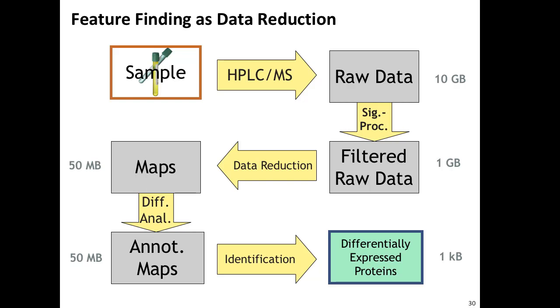The underlying assumption of doing quantitative proteomics is that the shifts in the proteomes are usually subtle. The proteome never really changes drastically. It's a common misconception that the proteome changes a lot. When you measure the same organism, might be biological replicates, might be different tissues, then these proteomes are not vastly different.